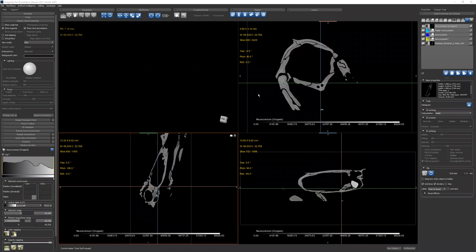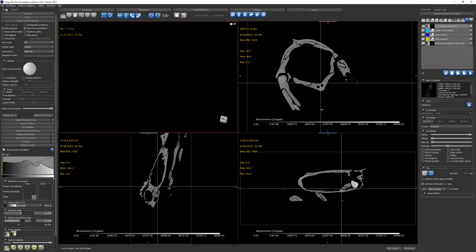Okay, what do you save and what do you keep as a project when you're working on this? In Dragonfly specifically, you want to always save as you go. If you're really spending a lot of time on something, I would save every 10-15 minutes. It can take some time to save, but go ahead and save. What you're saving when you do that is an ORS session, and that includes all of these things. Everything up here gets saved in a session, and a session is one file.